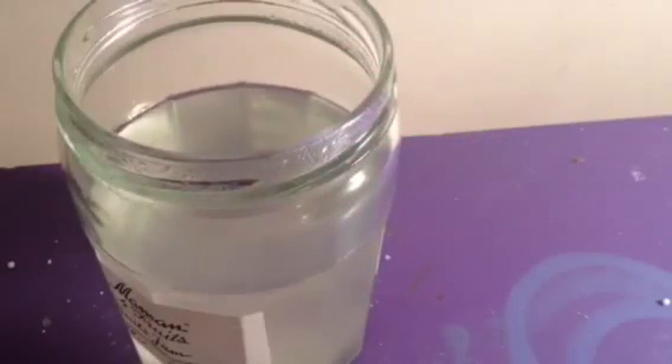Hey YouTube, I'm back. It's been a few hours later. Do you see that? It's like at the bottom — that's chloroform, right there. Looks like beads. It's pretty cool. I used bleach and acetone to make it.